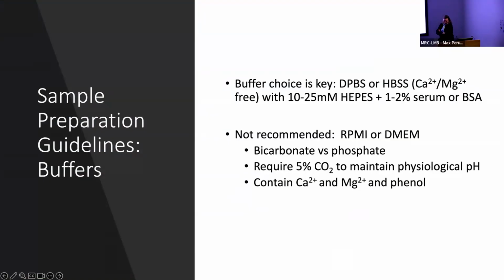When you're fractionating out cells of interest, you want to do this in a timely way to preserve viability, and of course any downstream functionality, particularly if you're planning on expanding anything in culture for downstream assays, for example, cytokine production. So it is really important to have a really excellent single cell suspension to ensure the best possible flow while minimizing doublets, so that's more than one cell stuck in the interrogation point.